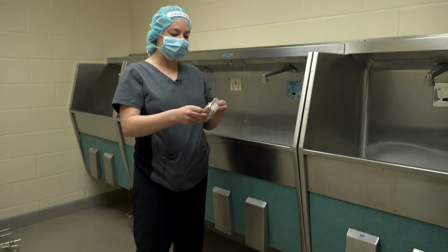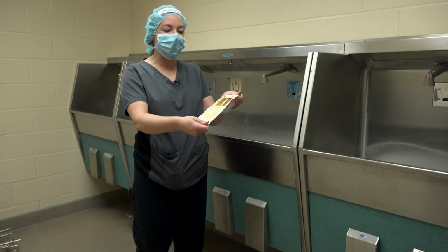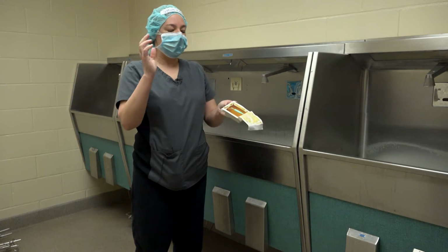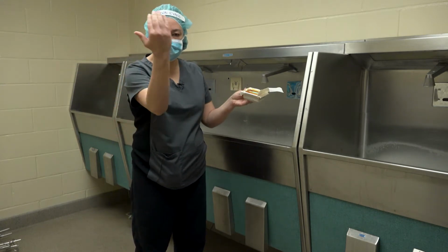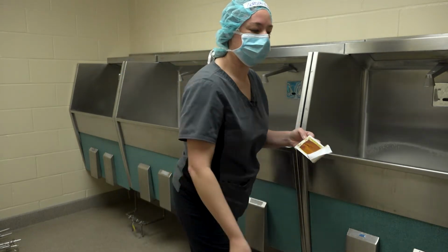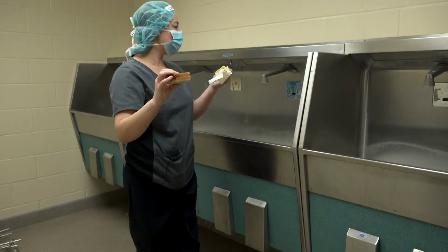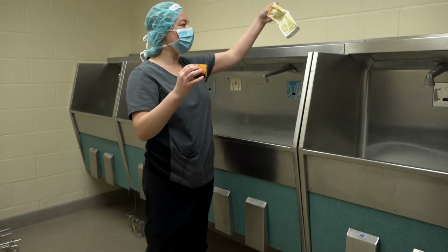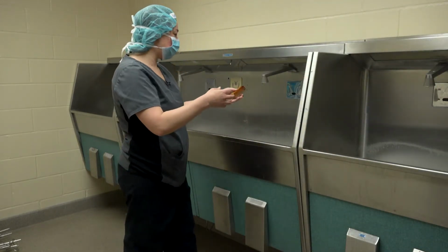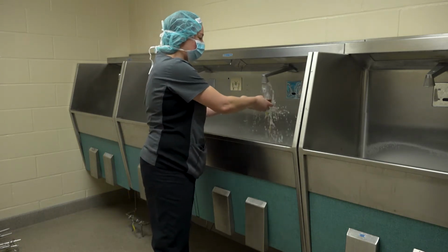Then we scrub. So first thing is that you open this up, and if you need help with your nails, you can open this up and then just take the little nail pick out and do your nails first. After that's all done, my nails pristine. I keep them that way on purpose. So then, I'm gonna throw that away, and then you take out your scrub brush, you throw away your little packet that's on the outside, and then what you do is, this is water, you just wet it.